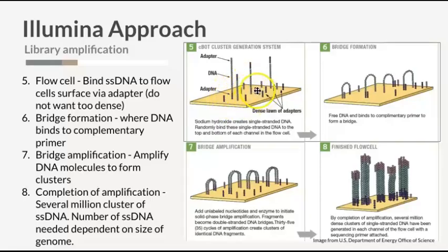So you can think of an adapter as basically being complementary to the adapters that you had ligated to your DNA fragments. Because they're complementary, this single strand DNA is going to find an adapter here, and it's going to be able to form a bond together.